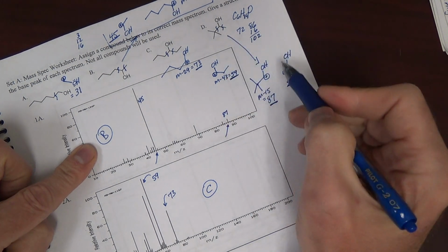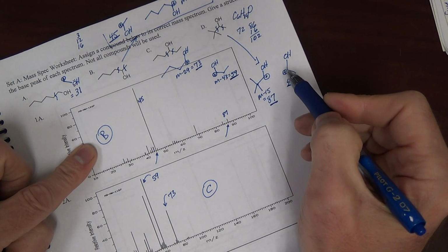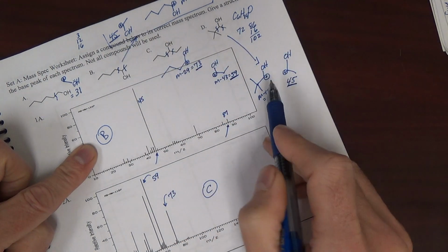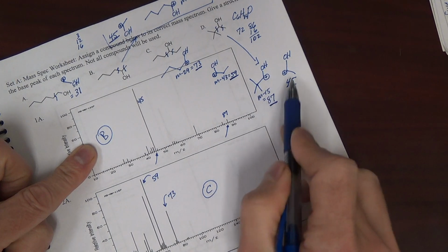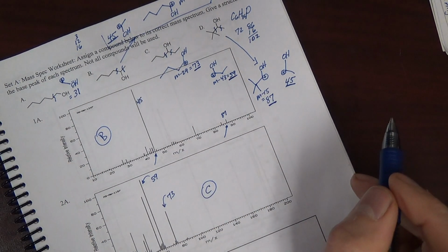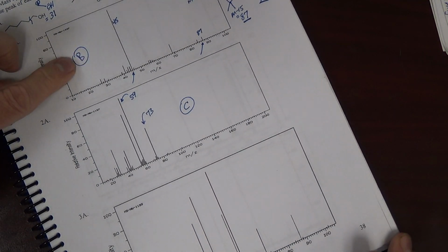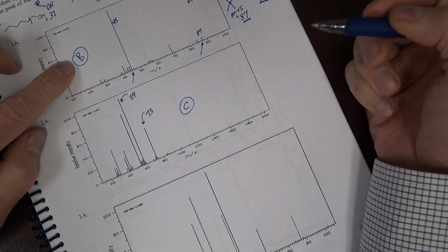87 and 45 coming from these two cleavages. Again, we predicted the same molecular weight ions for B. Okay. That makes me wonder if this is actually compound B here, or if maybe this is compound D. How are we going to tell the difference between these two?